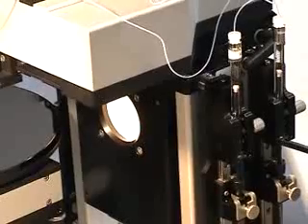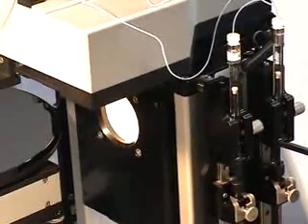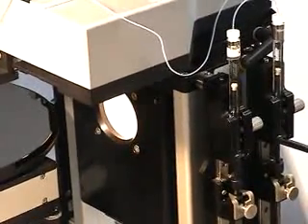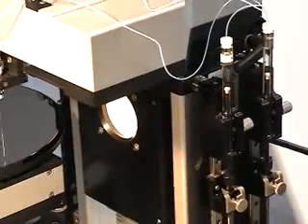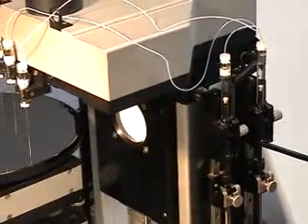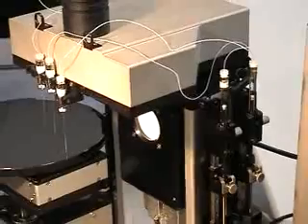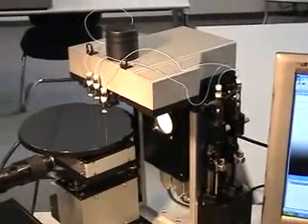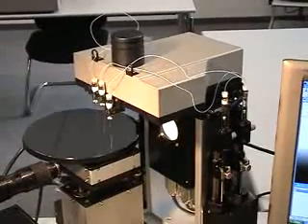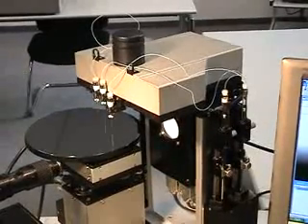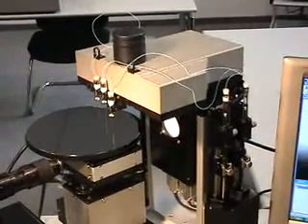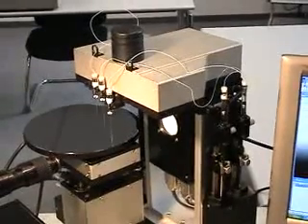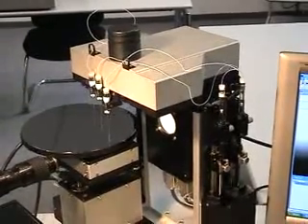In the next step we will show how to assign operating procedures to the instrument to perform a surface energy analysis. In the second stage of this movie we will also show how to dose more viscous liquids, for example resins, with a higher viscosity of several Pascal seconds.